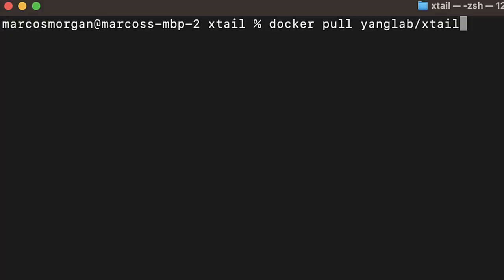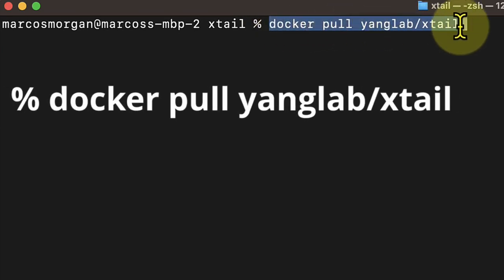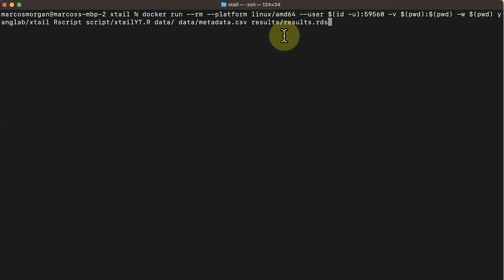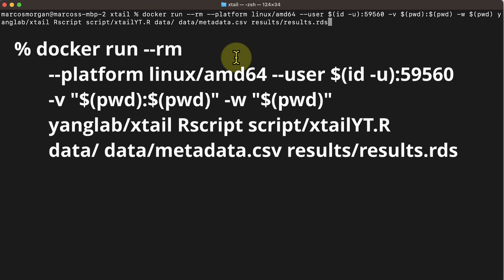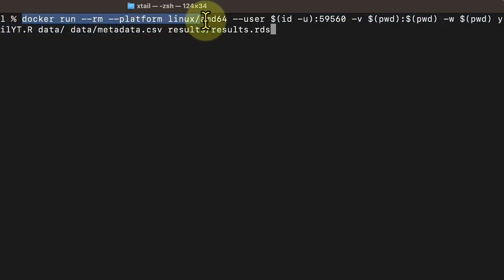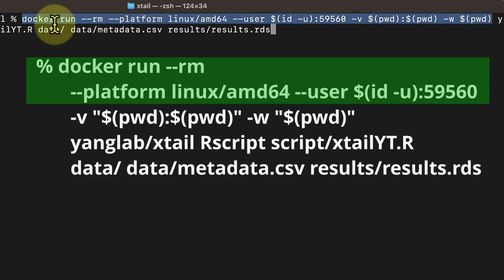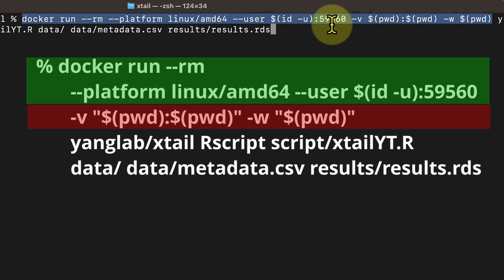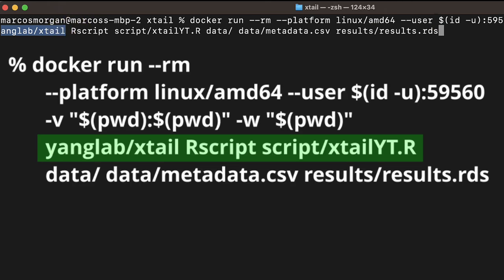If you don't know what Docker is, don't worry — I'll show you how easy it is to use. You won't have to deal with installing dependencies and so on. The first thing you need to do is install Docker, and then download the XTail library using a Docker pull command. I've already done this, so we move to the next step: launching the script using a Docker image. Here we have some parameters that first call Docker and then ask to mount the directories we are using.